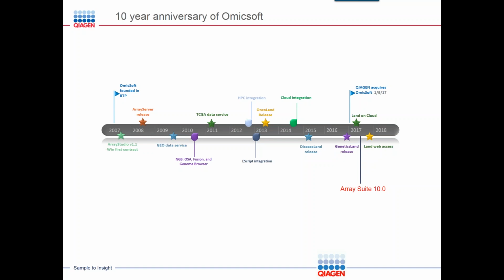And today we have a release of Array Suite 10.0. Early this year, which actually marks another landmark for this journey, QIAGEN acquired Omicsoft. You guys probably already knew about that.